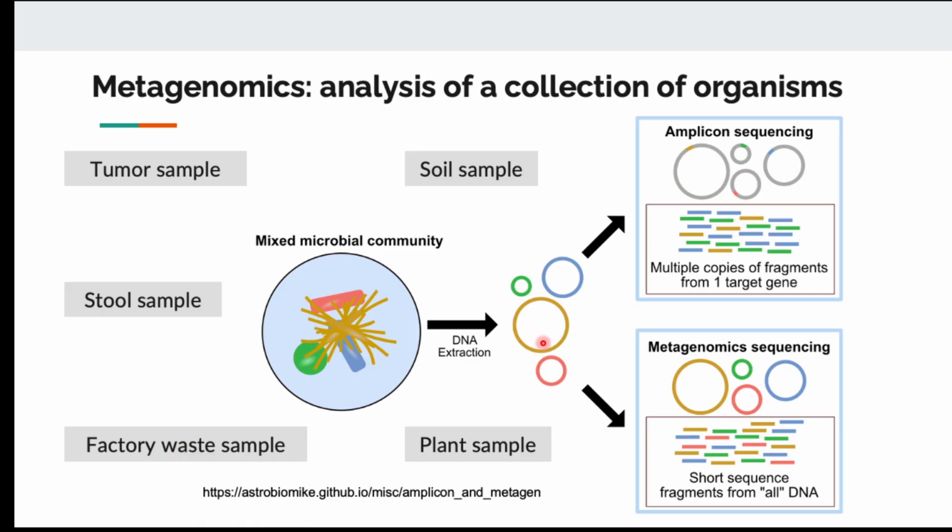So there are two primary ways to characterize a metagenomic sample. You can focus on specific genes. So amplicon sequencing means that you are amplifying a certain gene, like ribosomal RNA, and study only that gene. So it's going to be not so complicated. But sometimes you want to study every gene in the sample. So that becomes a full-blown shotgun metagenomics analysis, where you study all DNA fragment or RNA fragment in the sample. So that can be much more complicated than a single genome situation.